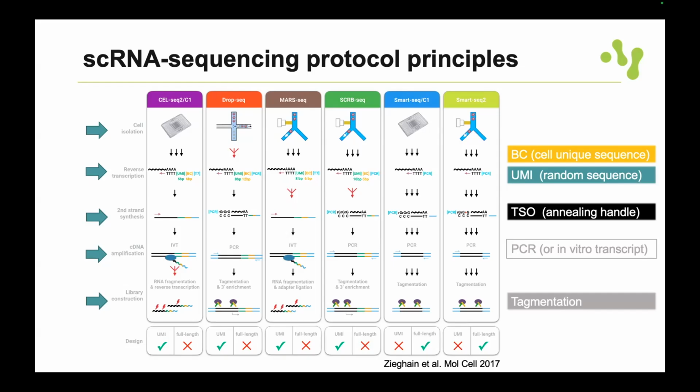And you have so many different unique ones, because of the 8 base pairs, and if they are all random, each of them will become unique. In this case, it was an 8 base pair, but nowadays they have become longer to be sure that they are unique. As the number of cells you capture scales up, by increasing the length, you will make sure you still get unique molecular identifiers.